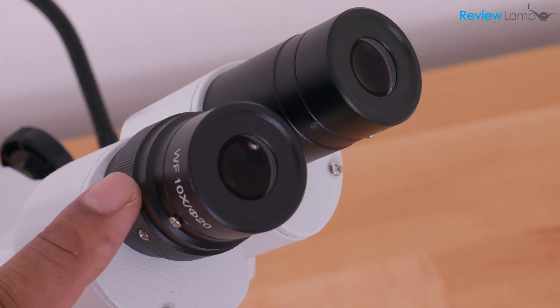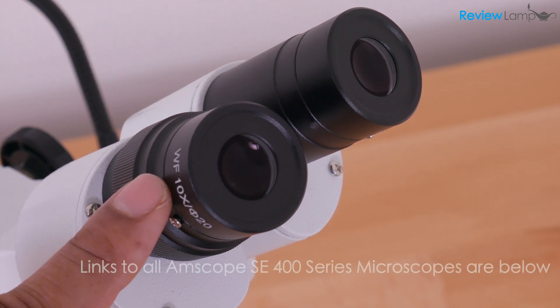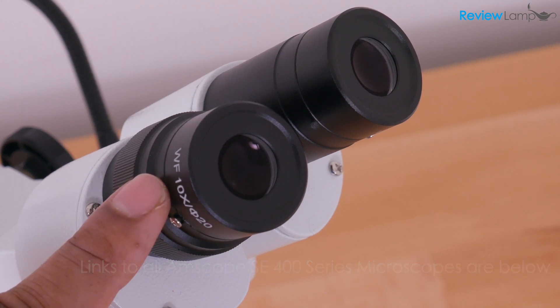Now on my model, right from the factory, they've already installed a 10x eyepiece. Now this will vary depending on the model you purchased, but I'm going to install my 5x eyepiece and I'll show you how to change eyepieces out. And I actually prefer the 5x eyepiece for electronics work, which is what I'm going to be using this for.